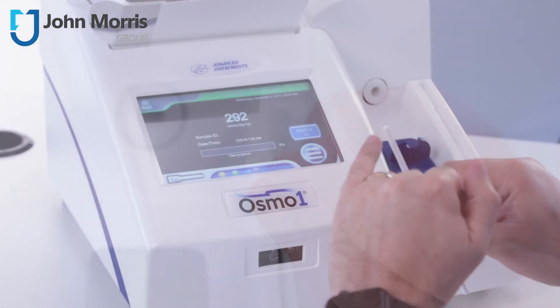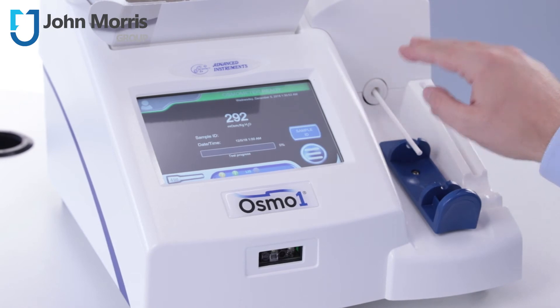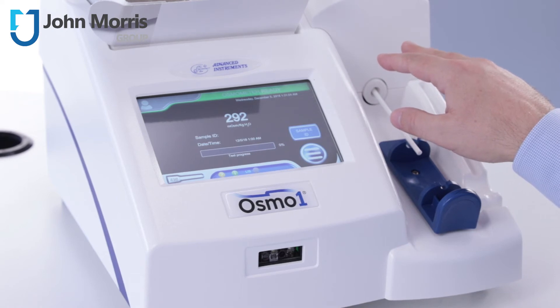If you're not going to use the osmometer for a while, it's always best to reverse the chamber cleaner and leave it right up into the probe assembly itself. This stops any moisture or environmental dust from collecting in the delicate measurement areas. So let's have a look at how we do a run.